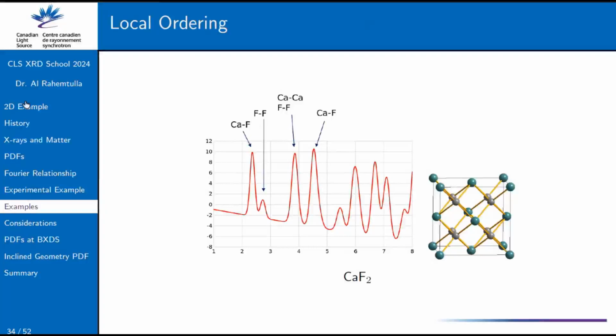So in this case, we have a calcium fluoride matrix, and we can map out that this here is the calcium fluoride, and second nearest peaks within this unit cell. We can go on to solve structures and model structures using big box or small box models, which Graham's going to be talking about in more detail in the next talk. So I'll leave that for him.